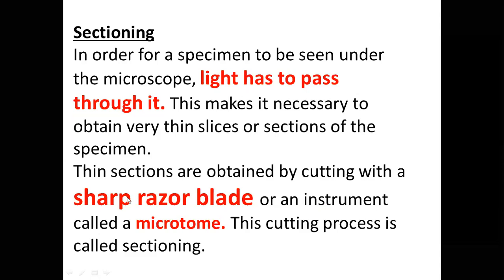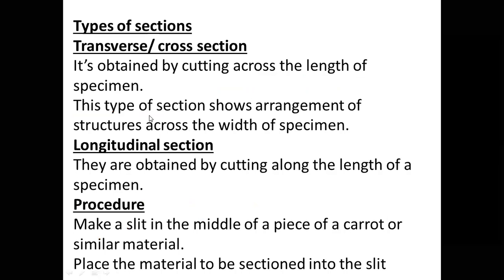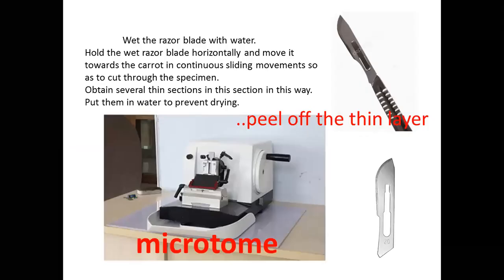But now, let's go to the next level. Now, sections, of course, if it is a tissue, it can either be a longitudinal section or a cross section, like the one that we have seen of 2016. It was a cross section. Now, here are the tools. This is now our blade or a scalpel, and sometimes a scalpel may be mounted on a handle. Now, this is our microtome. That is our tool that we call a microtome. And since it is mentioned in our Form 1 book, it is good just to know it.